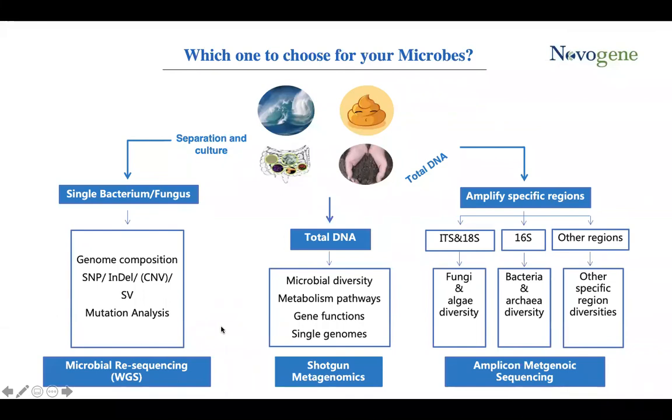Well, the sample number basically depends on your project, but we do have some data amounts that we could recommend for this statistical power. We have several packages, and from our experience, we recommend 100K reads for each sample. That data is enough for our subsequent analysis.